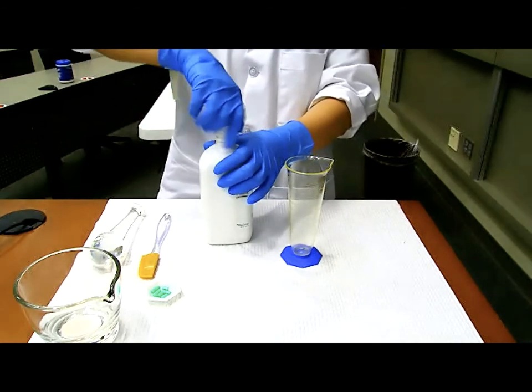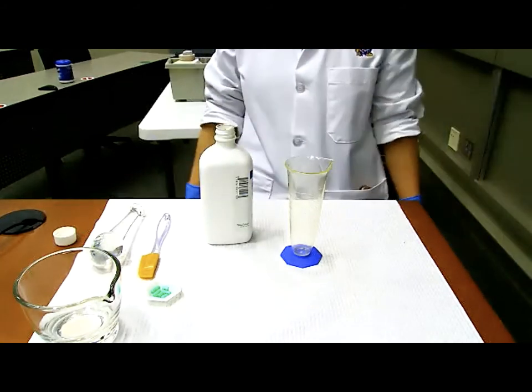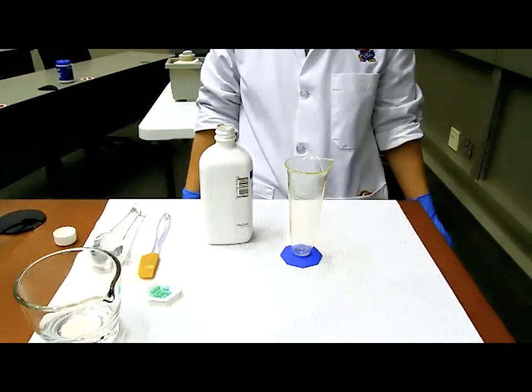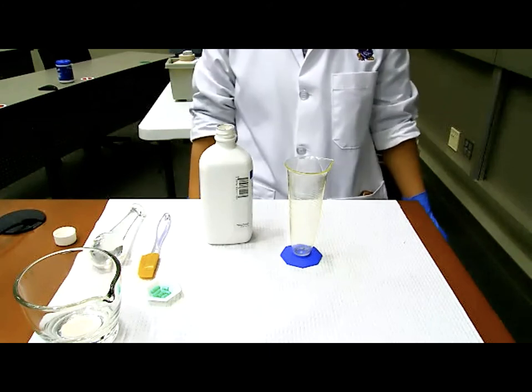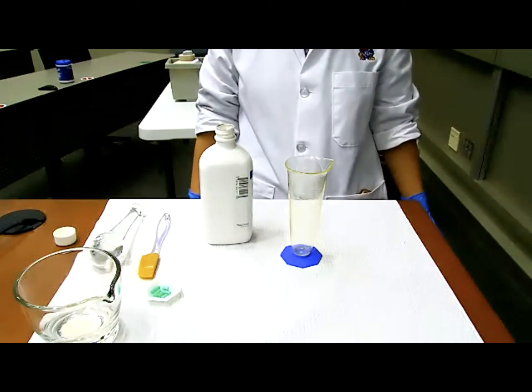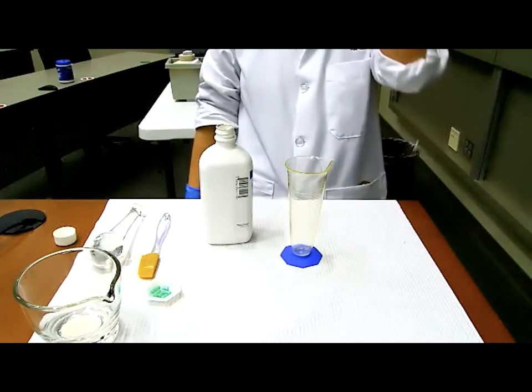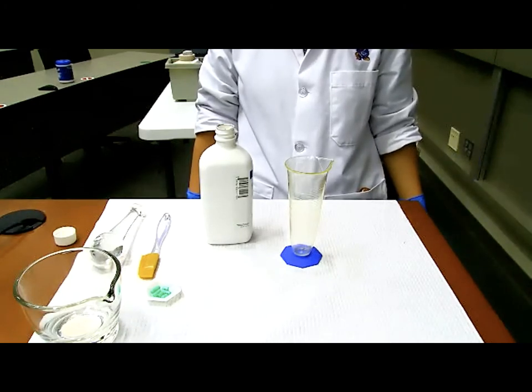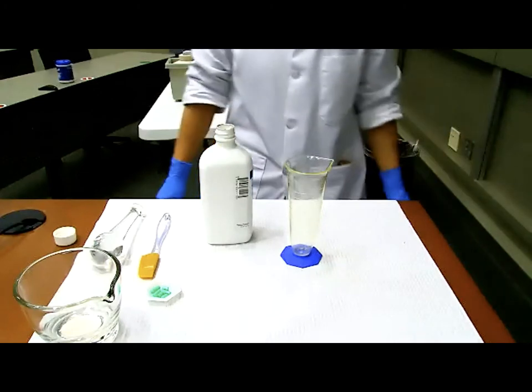Judy, let me just, before you do this. Yeah, go ahead. Why did you shake the oral blend container? That's a good question, because they could potentially separate out. So just like your suspension needs to be shaken every time before the patient uses it. I bring this up because on Monday, the student had poured out without shaking it, and it was absolutely clear. Remember how I said a suspending agent should be cloudy? Your oral plus, our oral blend, should be cloudy. It was clear because all of the cloudy stuff had settled to the bottom. So please remember to make sure the cap's on tightly, but shake your suspending agent before you measure it out yourself. All right, so we shook, and now we are going to measure.